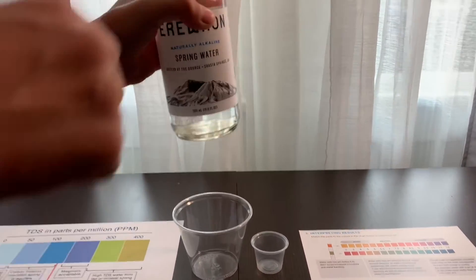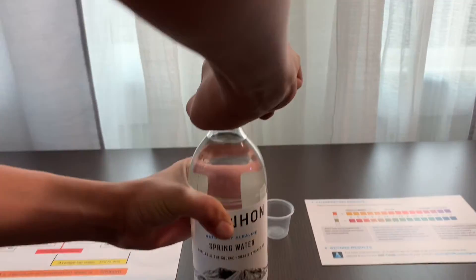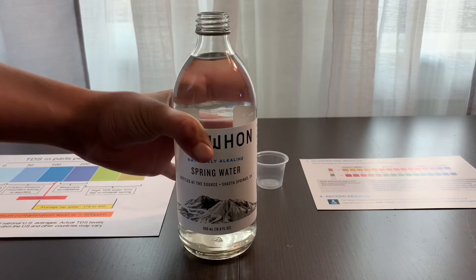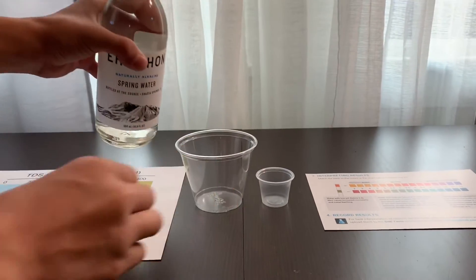Let's test the TDS and pH levels. Let's pour some water in.